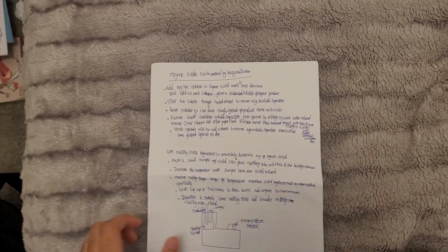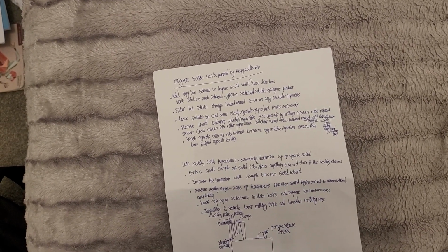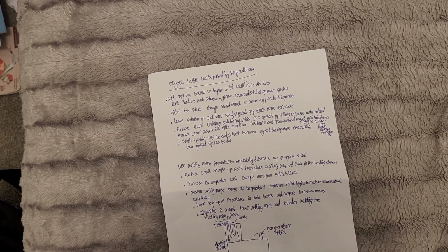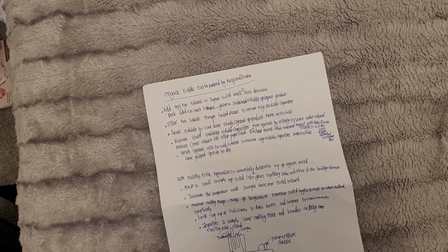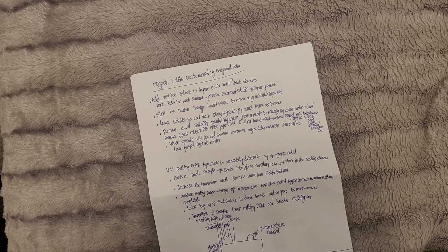Organic solids can be purified by recrystallization. What we want to do for this, we want to add very hot solvent to the impure solid until it just dissolves. We don't want to add too much solvent because this will give us a saturated solution of impure product, and that's not what we want.